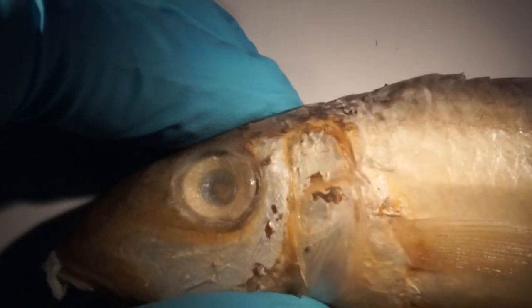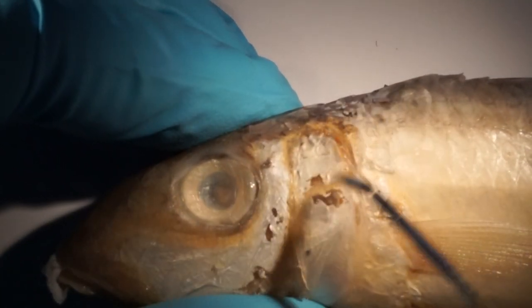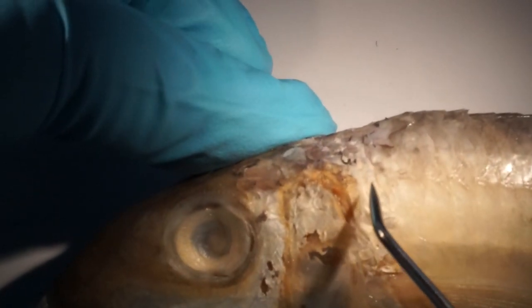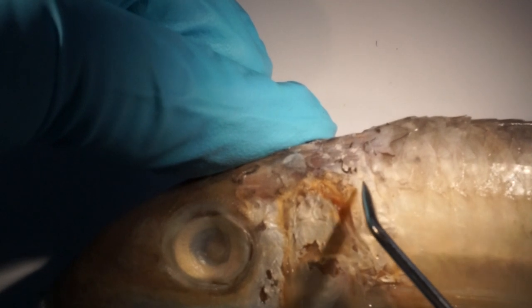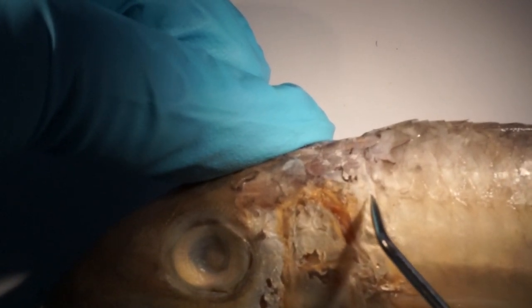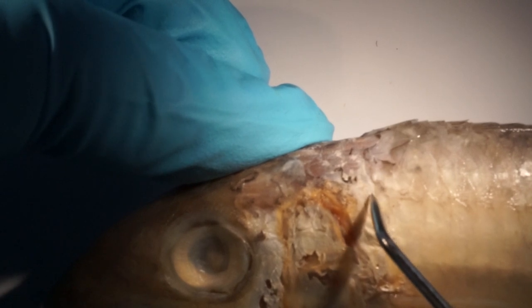We are starting just behind the operculum — the gill cover — trying to find the lateral line and then we start immediately here. The first, most anterior scale is missing in this specimen, but there is a hole so we can count it.